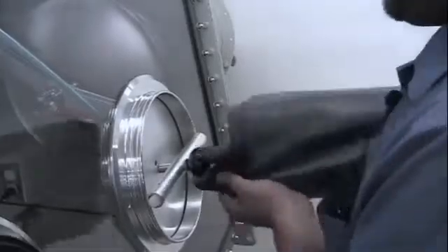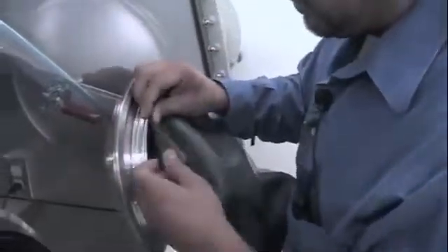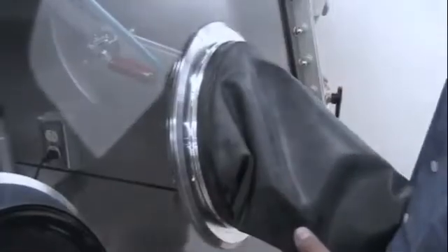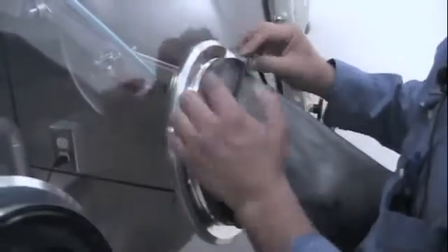I am now going to install the glove, assuring that the lip of the glove sits right along the groove that is closest to the window. Then we install the glove o-ring on the second groove on the glove port cover, farthest away from the window.